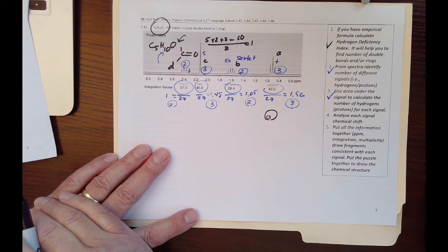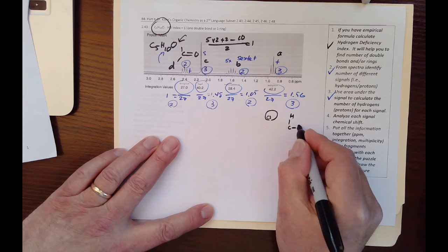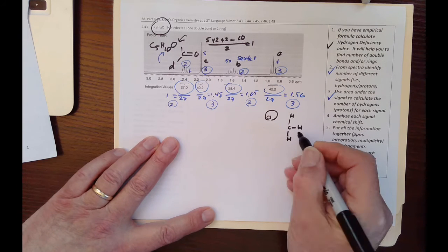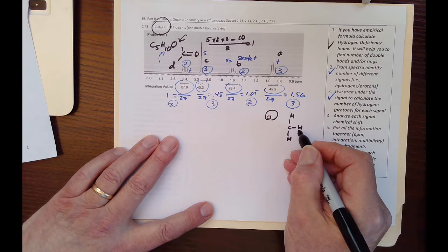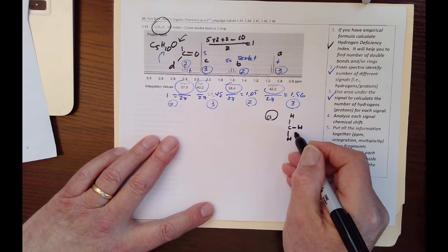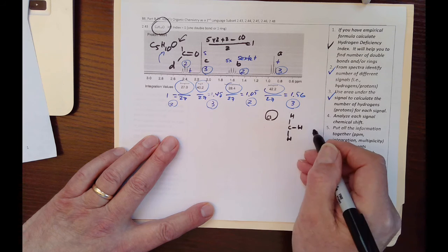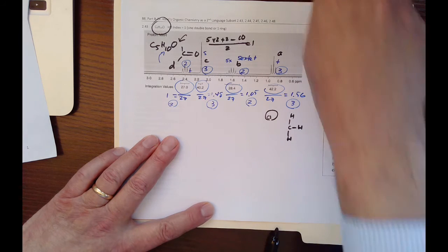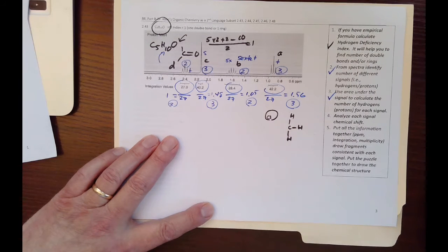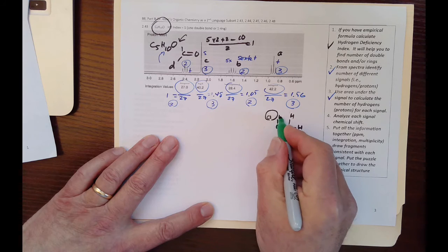So what does it really mean? If I have 3 hydrogen here, and these 3 hydrogen around 0.9 ppm became a triplet, that's the part we need to look at: what's next to it. I can't have anything on this side. On the left side, let's use a green color, I have 2 hydrogen.